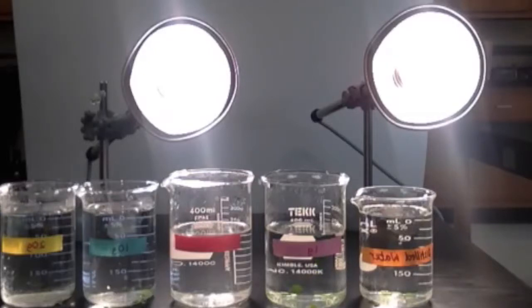Not only did more discs float to the surface, the number of floating discs increased rapidly compared to the other solutions. The similarity of the rate of photosynthesis in the 5, 10, and 20 gram solutions may be due to H2O, which is another reactant, becoming a limiting reagent. Their lower rate compared to the 1 gram solution may be due to excess Na+ in the solution that is generated from the baking soda, which is essentially sodium bicarbonate. The ions may interfere with the collision of H2O and CO2.